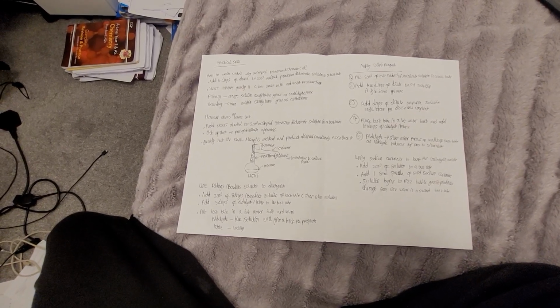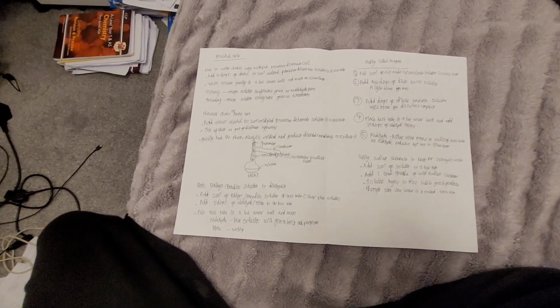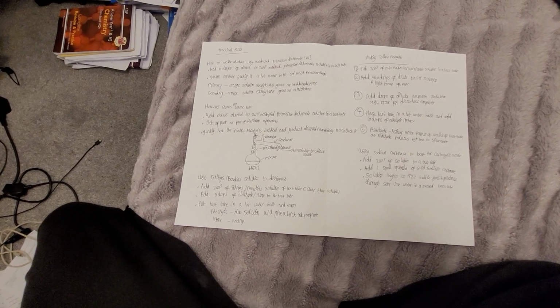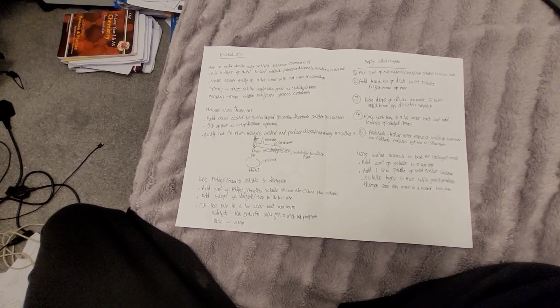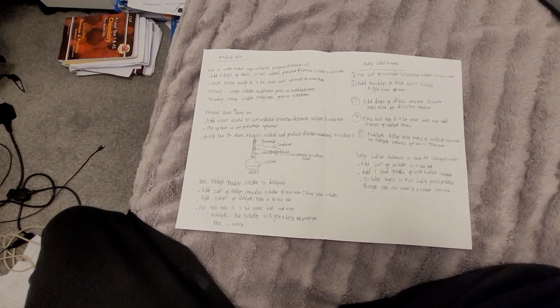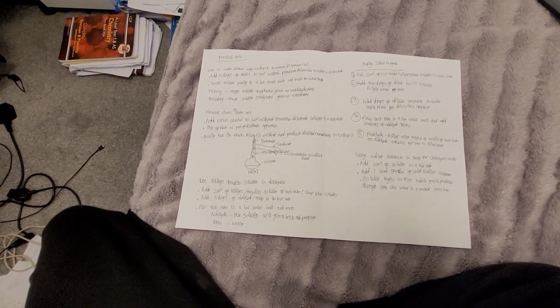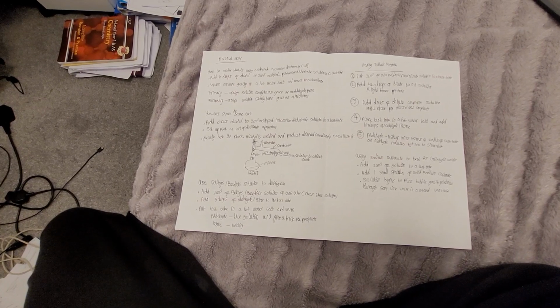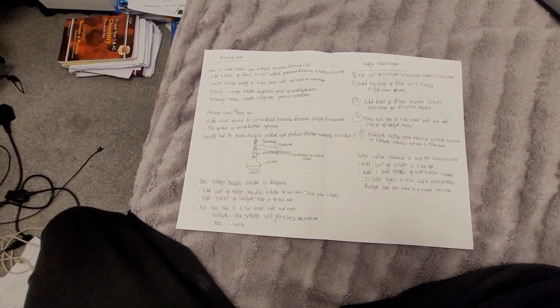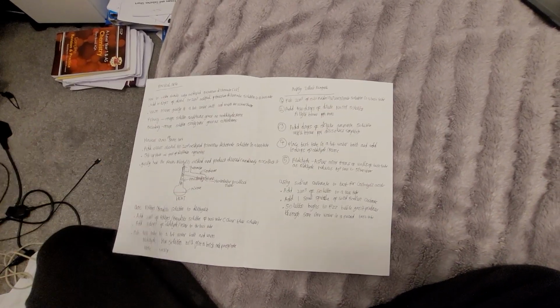Using Fehling's/Benedict's solution to distinguish between an aldehyde and a ketone. Add 2 cm³ of Fehling's/Benedict's solution to a test tube. What you should observe at this point is a clear blue solution. Add 5 drops of the aldehyde/ketone to the test tube. Put the test tube in a hot water bath and warm. If it's an aldehyde, the blue solution gives a brick red precipitate. Ketone, nothing happens.